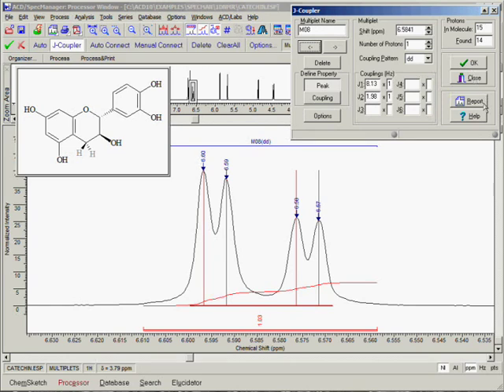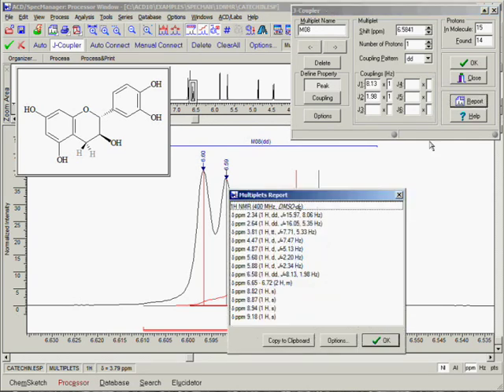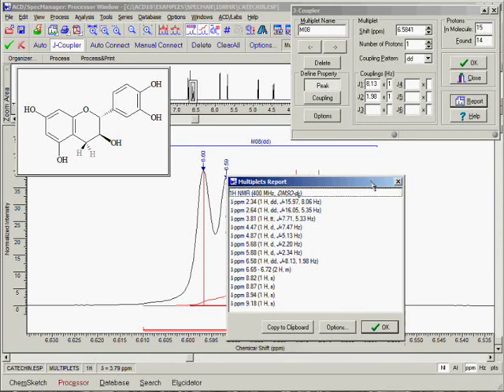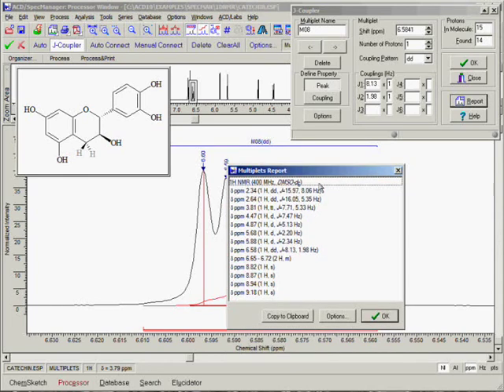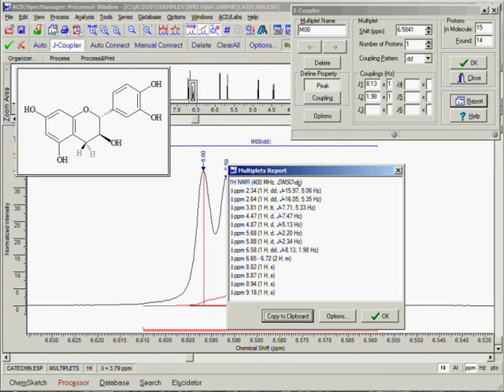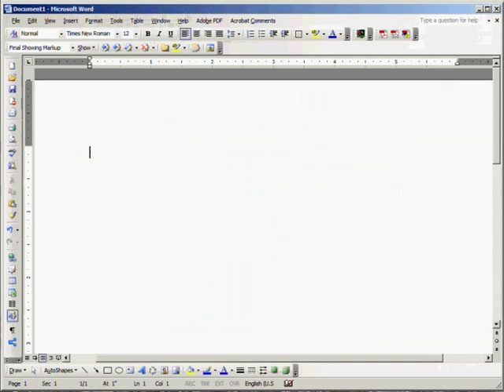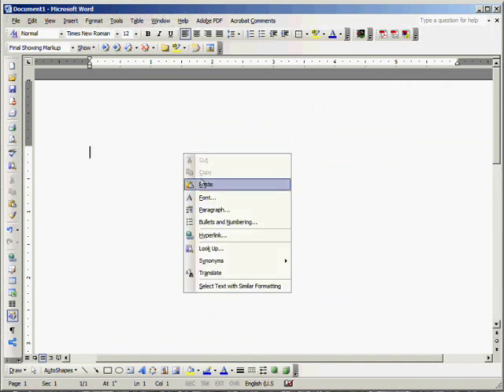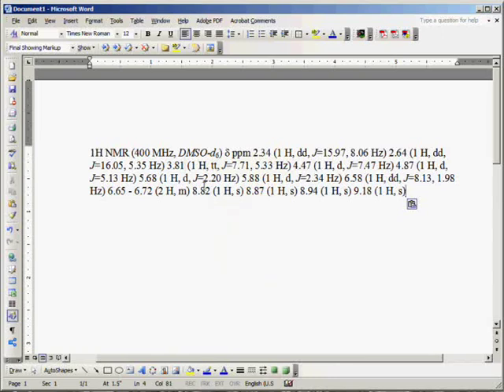We do this by simply clicking on the report button in the J-Coupler dialog box. A multiplet report window appears which contains all of the information that we just extracted from these multiplets. A nice feature is the copy to clipboard button, which copies the text to the clipboard so you can paste it into another application such as an eLab notebook or Microsoft Word. This gives you a properly formatted professional multiplet report with a minimal amount of effort.